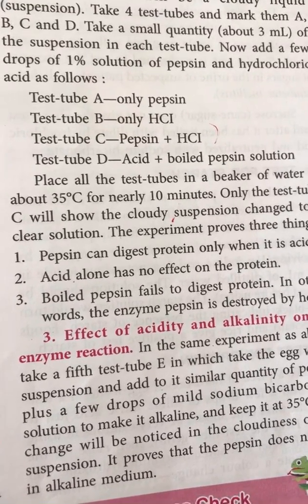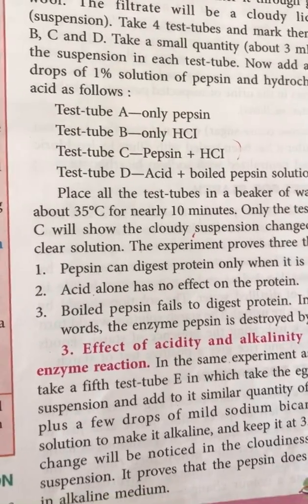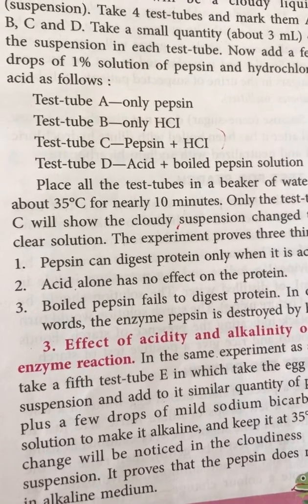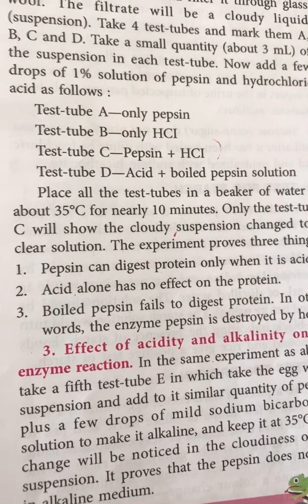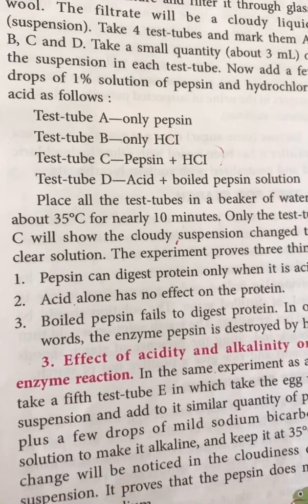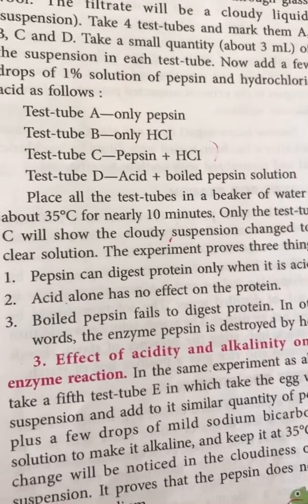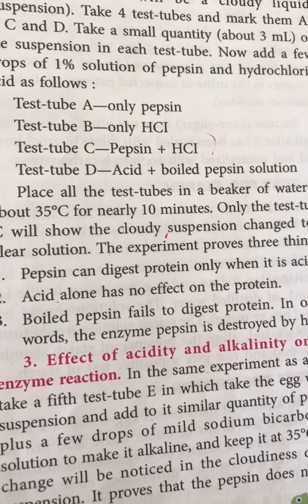Then the third one is the effect of acidity and alkalinity on enzyme reaction. In the same experiment as above, take a 5th test tube, E, in which you put the egg white suspension and add a similar quantity of pepsin plus a few drops of mild sodium bicarbonate.